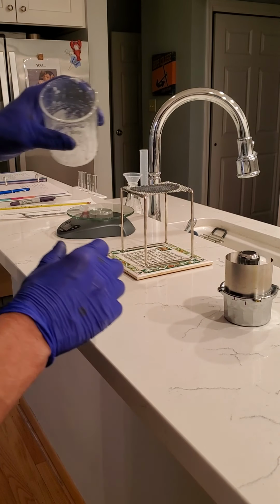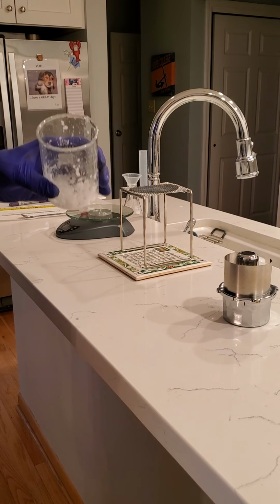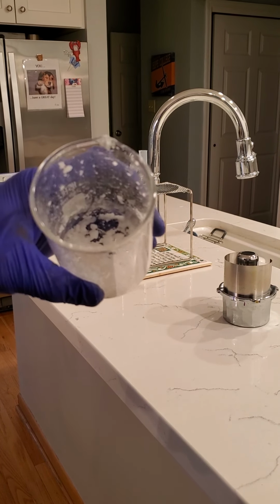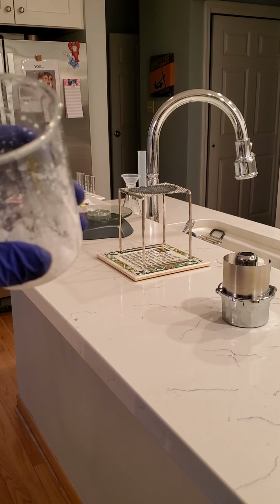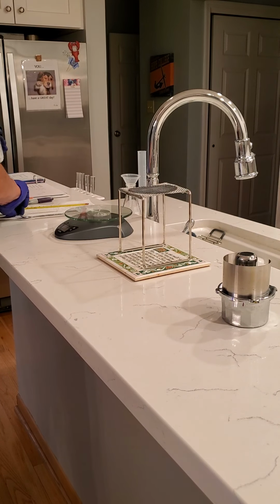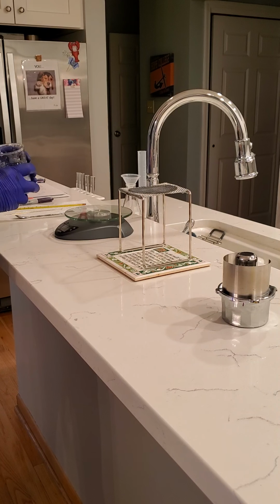Okay, class, we're going to take our final weight here. You can see all the water has been driven off in our beaker, and one source of error might be being able to drive off all the water in this salt using just the burner without having it splatter all over. But this looks pretty dry, so we're going to go ahead and take our measurement and see what we get.